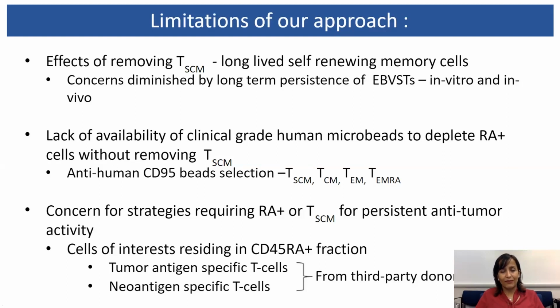Albeit with all these limitations, I hope today I have shown you that we indeed have established a highly clinically feasible CD45RA depletion approach to enrich antigen-specific T cells for our EBV-specific T cells, which is also applicable to generating virus-specific T cells that are specific to various viruses and potentially has applicability in other immunotherapy.